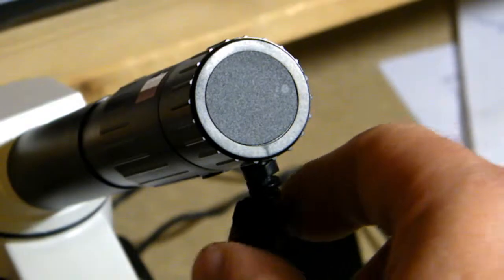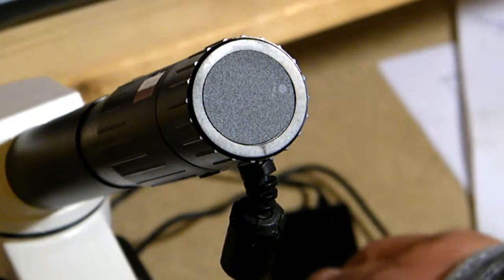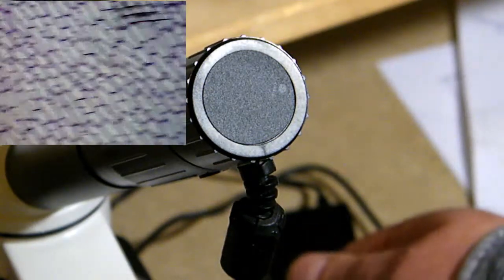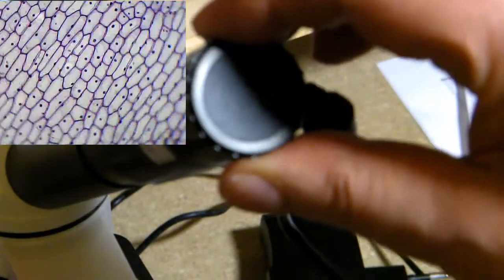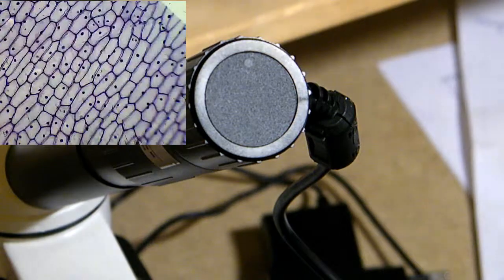Concerning the USB lens, it's important that the cables here go straight down in a 90 degree angle. There is a small sign here. It should show completely to the right, because when I use the slide stage and move the slide stage here, left and right, on the screen, the object, the specimen, should move also left and right, the same as up and down. Let's turn it to the right, and then you see the direction of movement on the screen is different from the direction of movement of the slide stage.